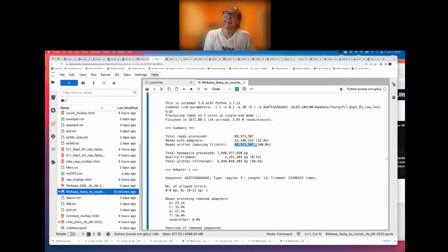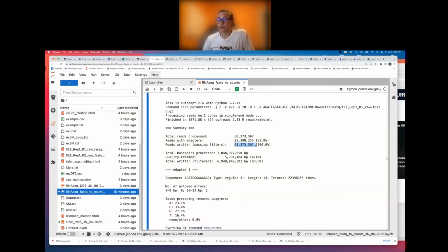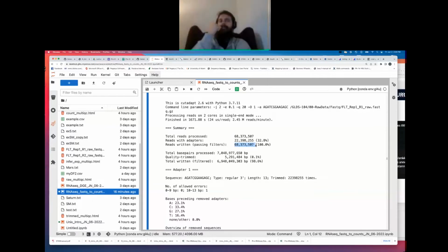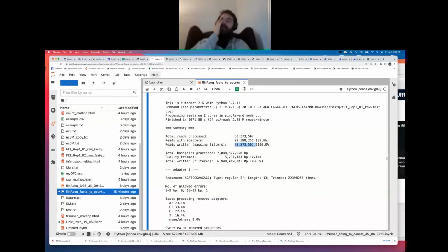Protein guy. Yeah. Why would that happen for the forward read? Remember, this is paired end data, and we know something special about paired end data. What does the number of reads in the forward and the reverse have to be in paired end data? The same length? It has to be the same length. So now does it make sense why it has not removed reads yet? We're just looking at the forward right now. Oh, because then we need to go and pass that against the backwards, and then we'll do the same filtering, and then we'll mash them together at the end, and then see if any of it actually marries up.